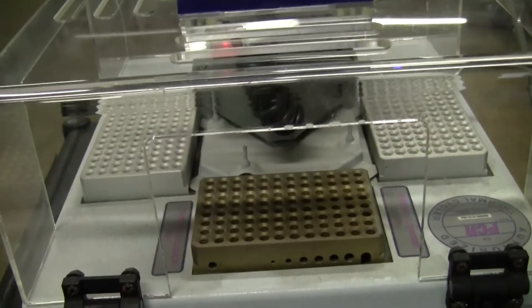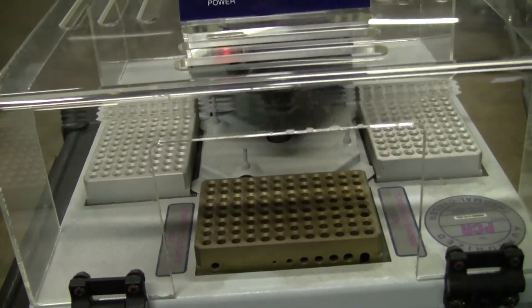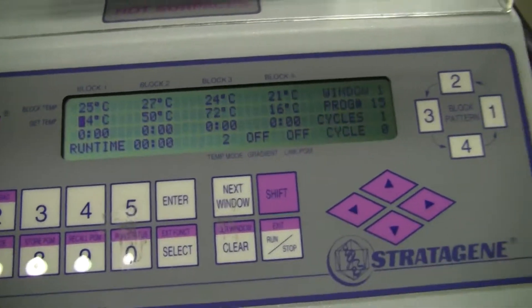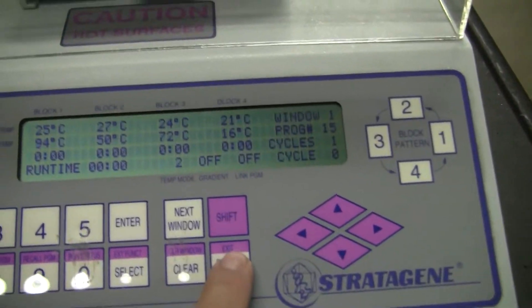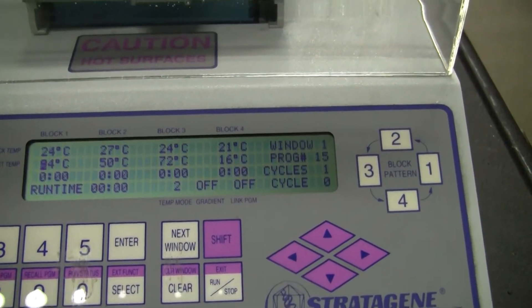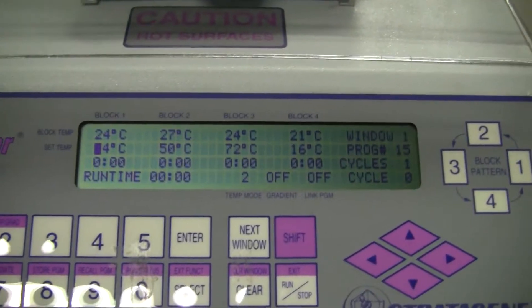Turning it off and on, see the automatic startup settles in, comes with the current temperatures. Now I just hit run to make it go. It's going to achieve some set points.